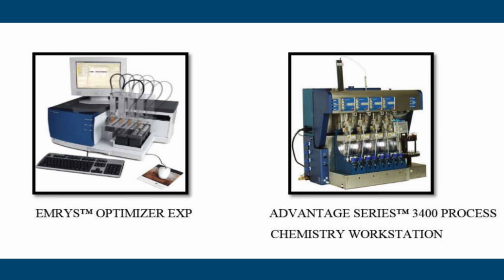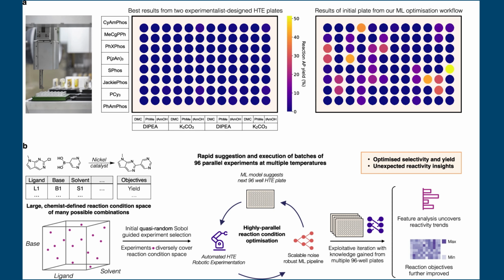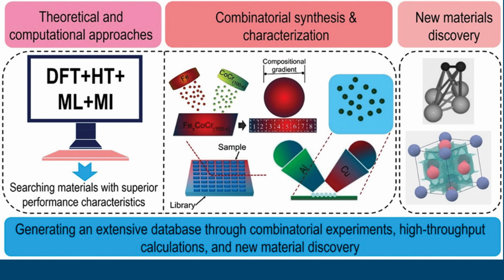The successful implementation of combinatorial chemistry relies heavily on specialized equipment and automation technologies. Robotic liquid handling systems, automated synthesizers, and multi-well plate formats enable high-throughput synthesis and screening. Analytical tools such as high-performance liquid chromatography, mass spectrometry, and nuclear magnetic resonance spectroscopy are essential for compound characterization. High-throughput screening platforms facilitate rapid biological evaluation, while computational tools support library design and data analysis. Despite the prevalence of automation, manual methods remain relevant in certain contexts, offering cost-effective alternatives for smaller-scale synthesis.